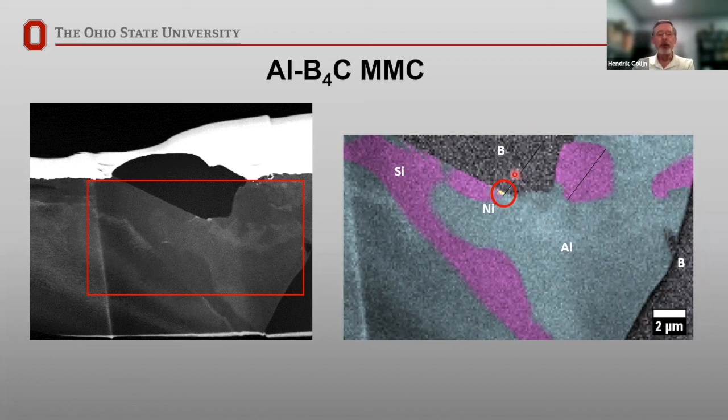But if you look closely, right here at this interface, we've got a high nickel signal. And this is beyond the resolution limit that you would pick up in an SEM.